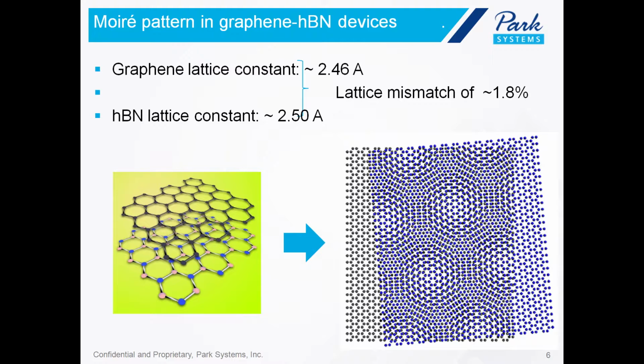The superlattice constant is going to be the portion of the sample in the middle that has a honeycomb type shape. You'll notice that if you focus a little bit closely here, you'll start to see huge, larger hexagonal shapes with areas of high regularity, vertical regularity between the graphene and the HBN, forming the cells of the honeycomb.